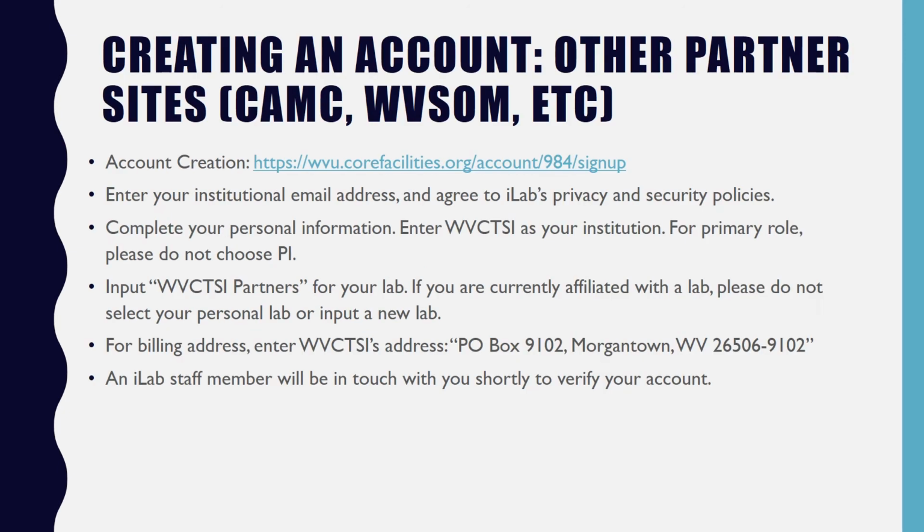I haven't relisted the screenshots, but if you're located at another partner site, such as CAMC or WVSOM, you'll follow the same instructions as the WVPBRN, with one exception. Instead of WVPBRN related areas, you'll enter WVCTSI as your institution and WVCTSI partners as your lab.